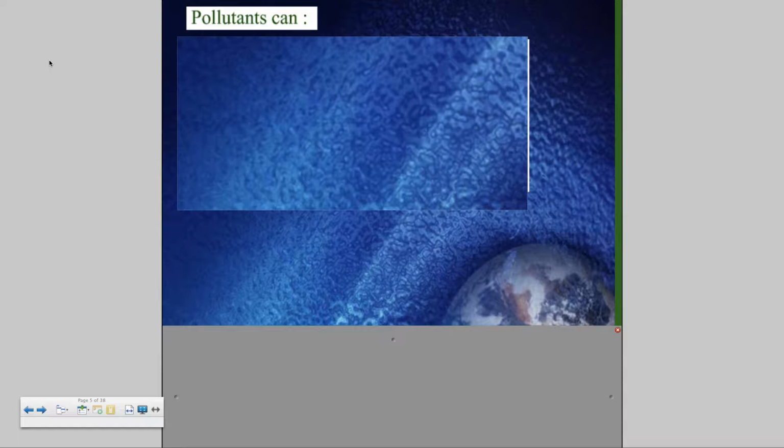What were some of the ways, some of the things we had to look at to test water quality? What were some of the things we had to do? Aaron, give me something. We did have to check turbidity. Let's stop right there for a moment then. What is turbidity? The clearness of the water. So how cloudy or how clear the water is, which means how much stuff is in the water. Doesn't always have to be dirt, but just how much stuff is in the water.